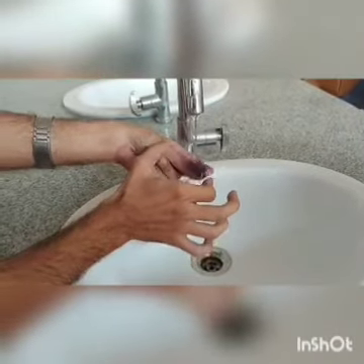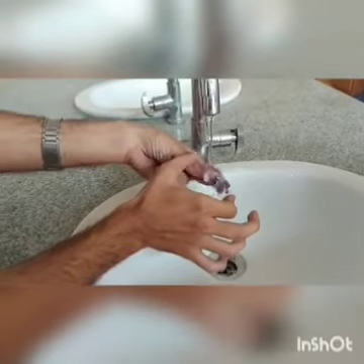Wash the back of the slide too. The slide should be washed for at least 2 minutes.